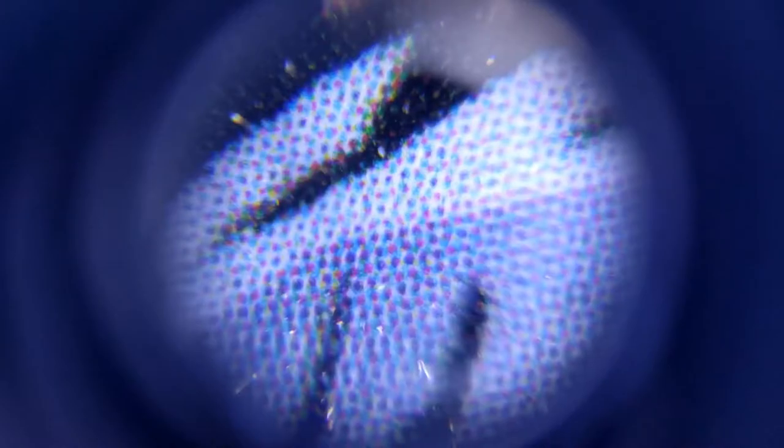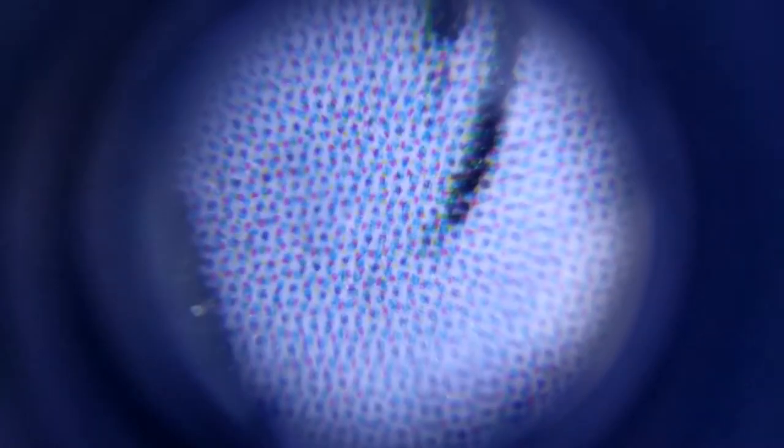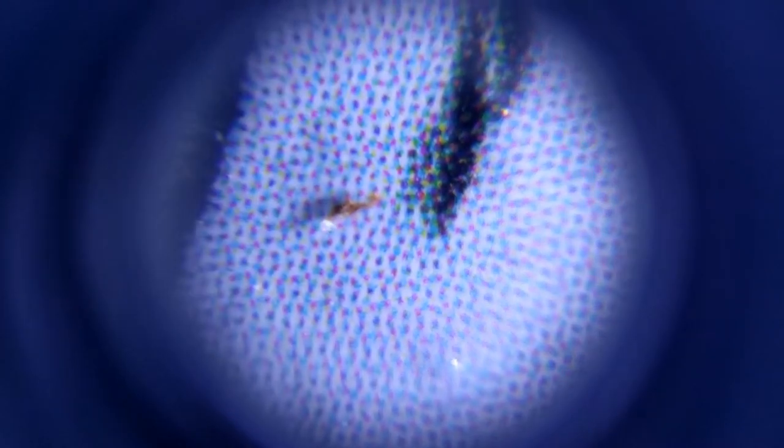Now let's look at some other stuff. Now we are looking at the tattoo that came with the curiosity box. You can't really see it, but it is some kind of animal. What you can see is that it is colored using dots: the red, blue, and I think it's violet. Here's something that I don't really know what it is, maybe some dust, and another thing I picked up was just some bread.